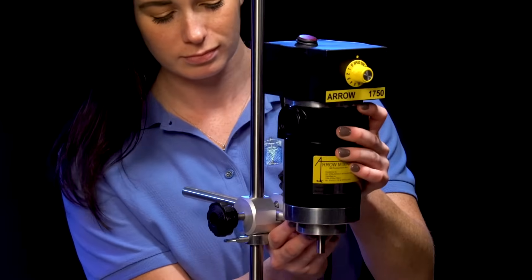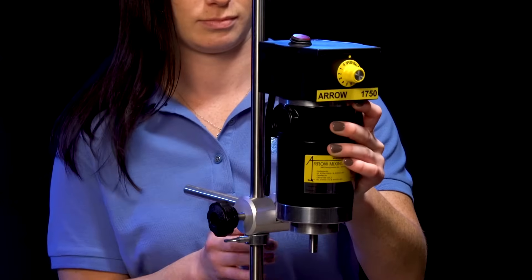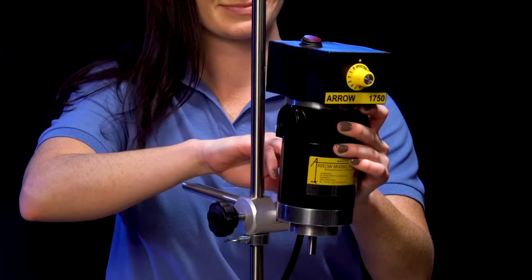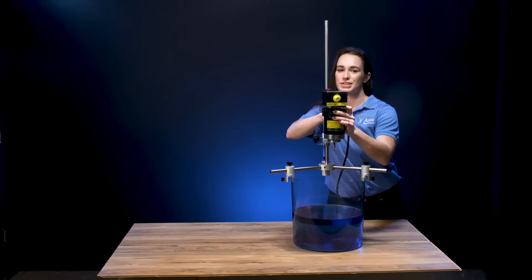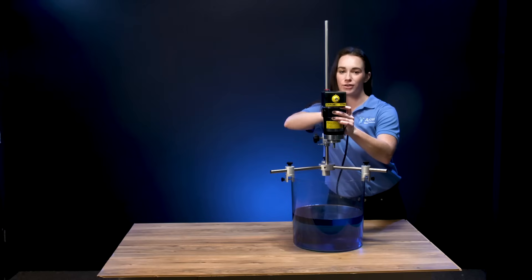Now, secure your Arrow mixer to the stand by sliding the stirrer's bracket shaft onto the U-channel of the clamp. Fasten the knob to secure the mixer at the desired angle and location.